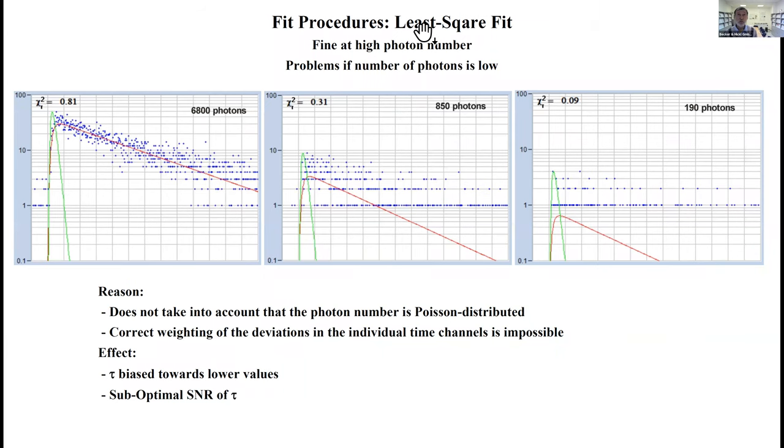You all know what the least square fit is. You have a model function, this is the right curve here. You compare the value of the model function with a measured photon number in this time channel. You square the difference, sum up all the differences, and this gives you a measure of how accurately the model function matches the fluorescence decay. This works very well at high photon number and at medium photon number it still looks reasonably okay.